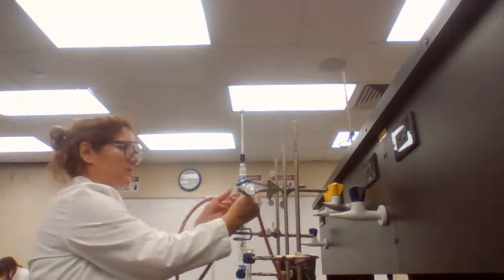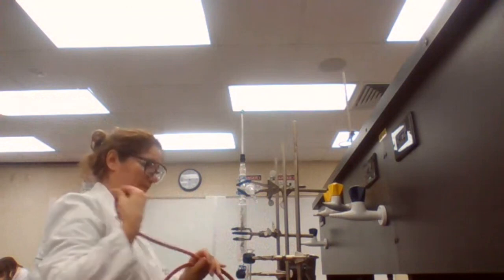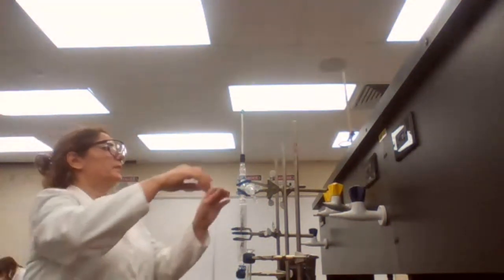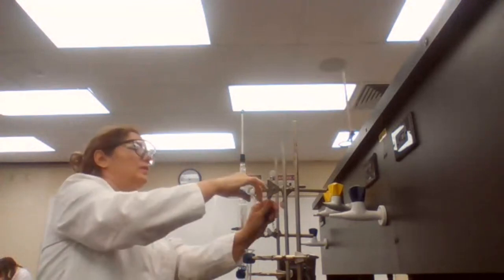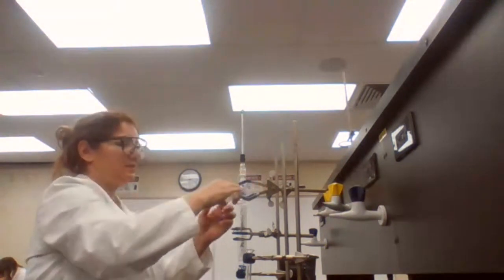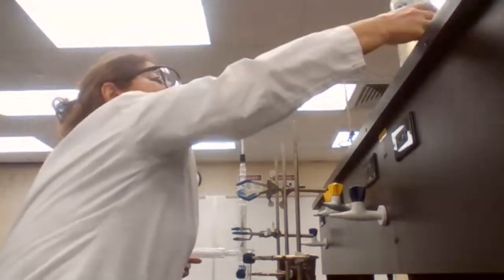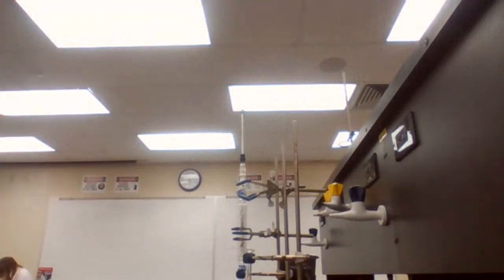So disconnect the hoses. Get the clamp out. And take the condenser out, just one piece at a time. Put it in the proper place, then go for the next one. We're going to have to wash this before putting it back.